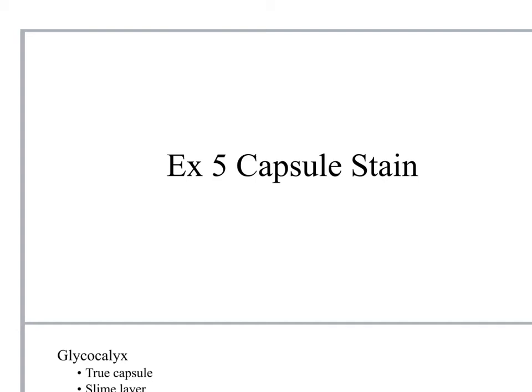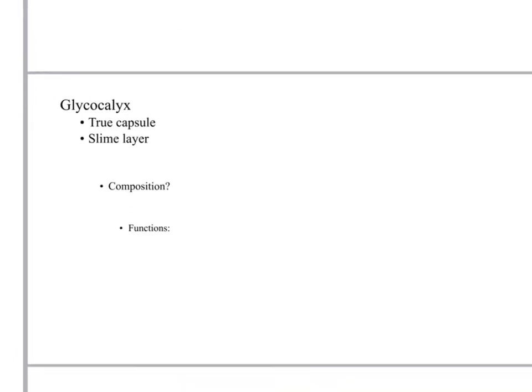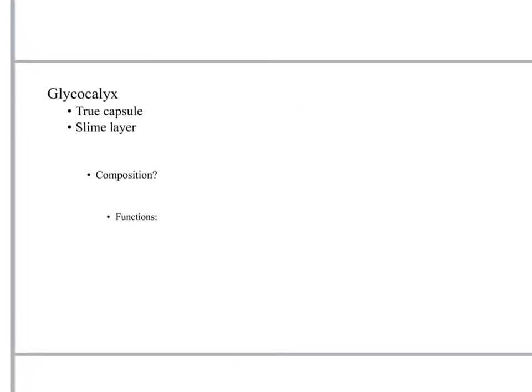Okay, with this video I want to explain to you what a capsule is, why it would be beneficial to bacteria to make one, and then a little bit about what we can do to the cells so that we're able to actually visualize their capsule. Okay, so a little shorter pre-lab for this lab.